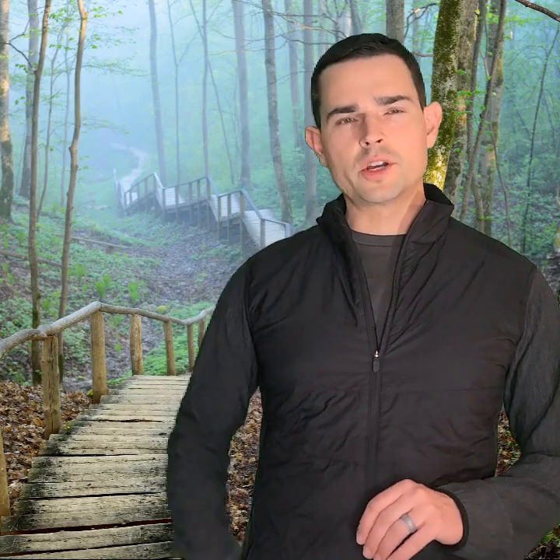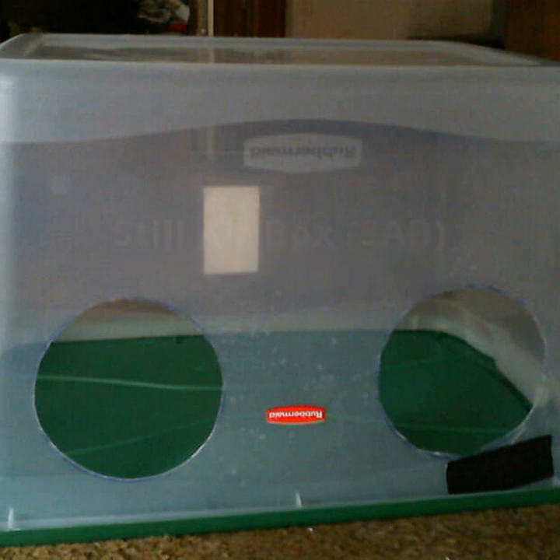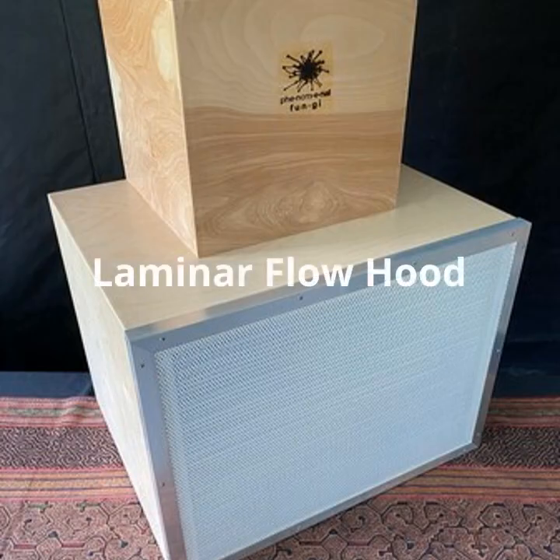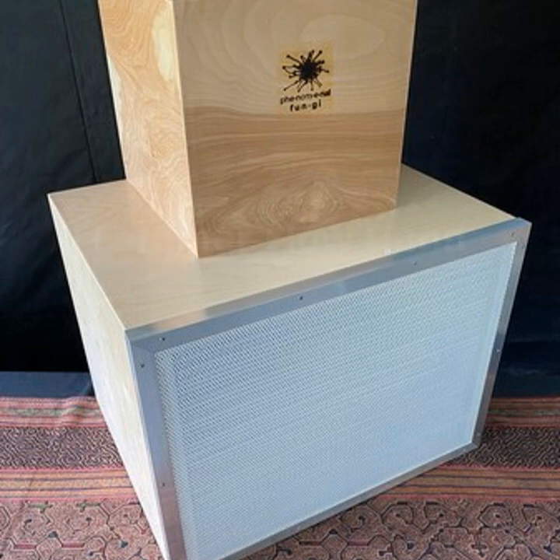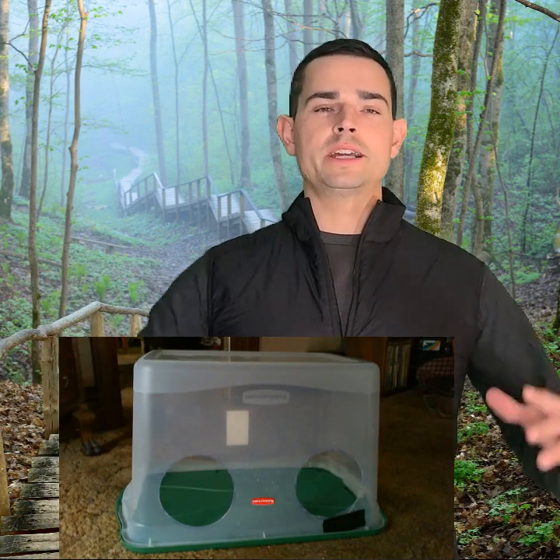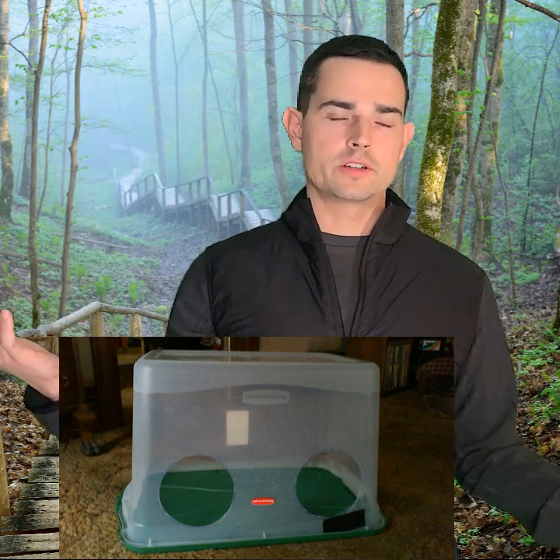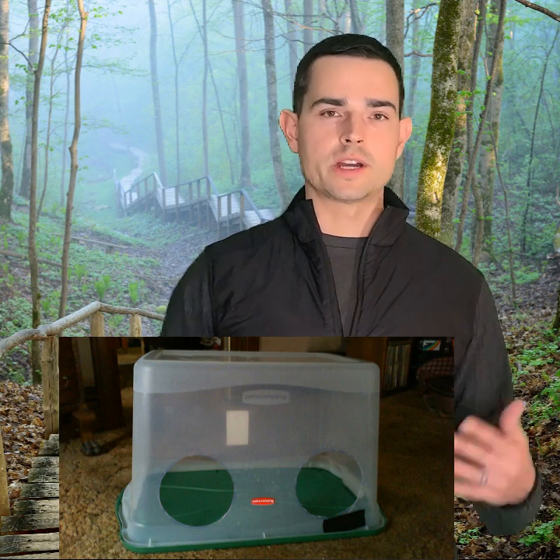Another important thing: when you're doing a lot of this work, you're going to want to do it in a still air box or a laminar flow hood. A laminar flow hood provides constant air pressure that inhibits debris from falling on your work area. A still air box is a similar idea — you're basically just trying to prevent things from falling on your work while doing a transfer from one agar jar to another or putting it into a liquid culture. The most important thing is to have a clean environment when doing your work.